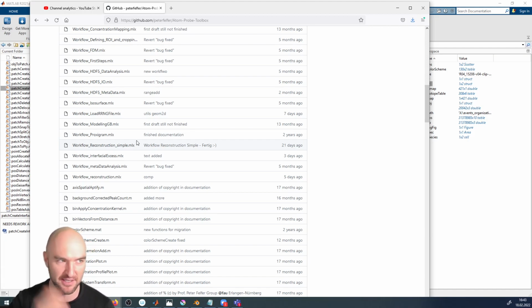So you have 100 data sets, just let it rip through 100 data sets. But they have interesting things like spatial distribution maps, for example. Other things that haven't been migrated is some of the cluster analysis.